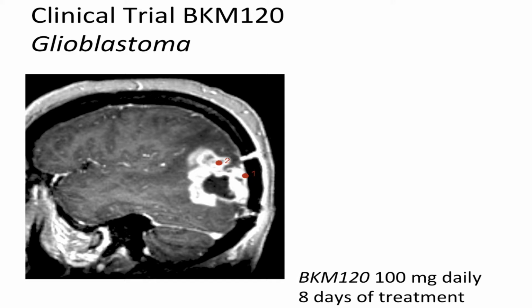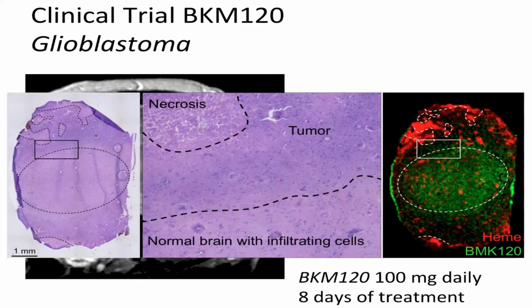And more what we're doing is trying to map the drug distribution into the brain this way to see how it relates to the 3D anatomy of the tumor, but also as it relates to the 3D anatomy of the brain, if we're taking into consideration the fact that the blood-brain barrier is not the same throughout the brain.